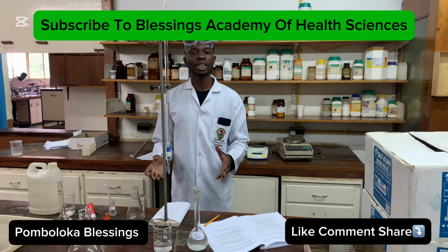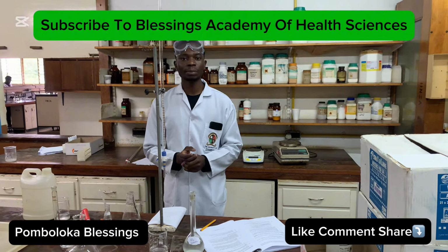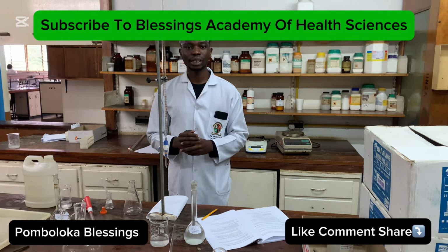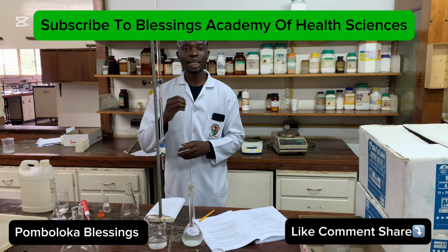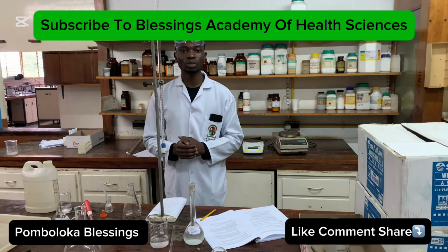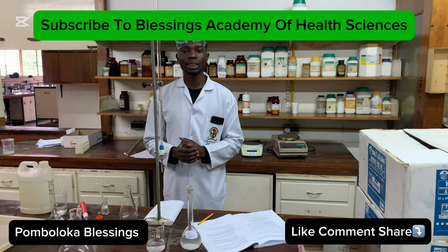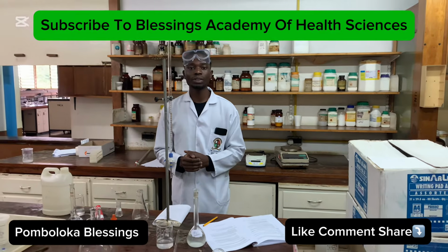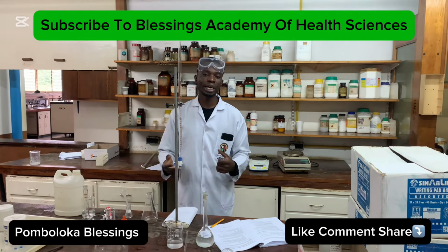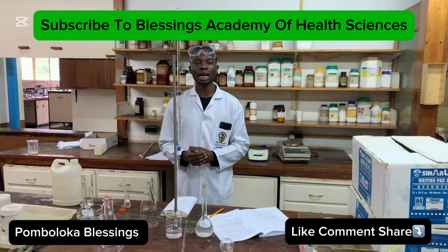So from there, it's quite easy to find out what moles of the ammonia were reacting in the first part of the reaction, because the acid in the first part was in excess. Because it was in excess, we use the second part of the reaction to find out what moles of the acid were reacting in the first part. Then we use the mole ratio, because we know that in the first part the mole ratio is 1:1, to find the exact moles of the ammonia that were reacting. Then from there, we can find the mass, and that mass is called the actual mass of the ammonia.